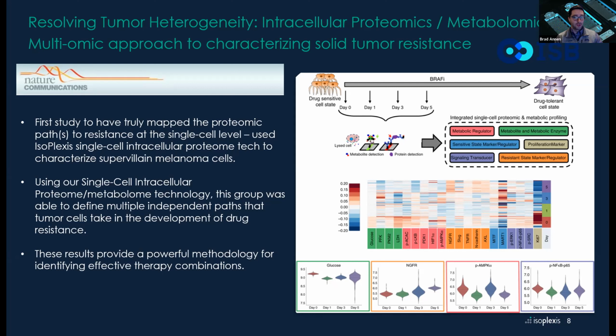From this information, they identified some combination therapies that resulted in complete and sustained tumor suppression in vivo based on the predictive data that we actually unlocked from that intracellular application and the data that was produced there.